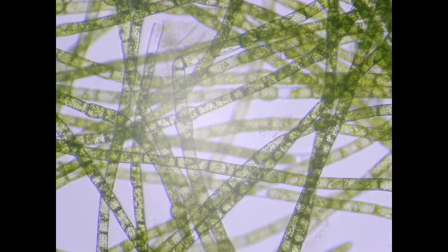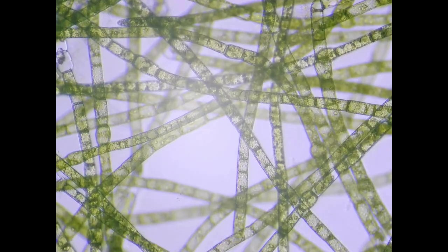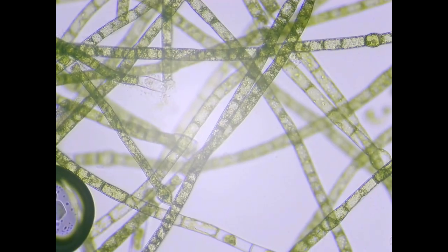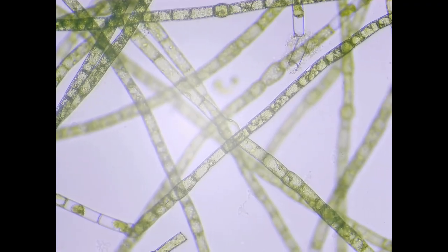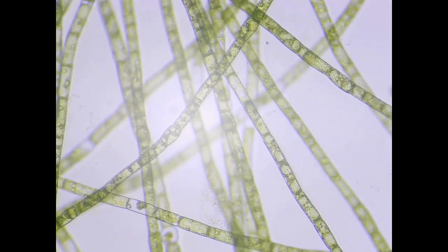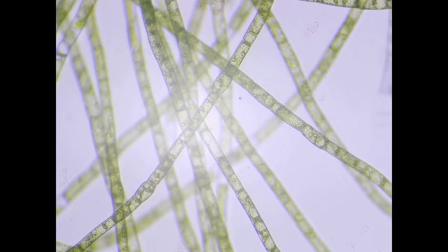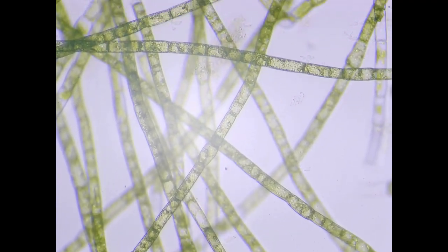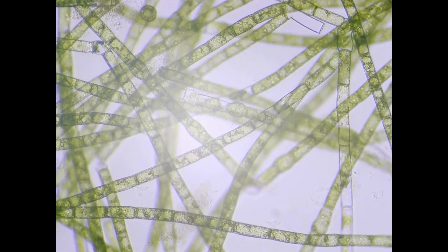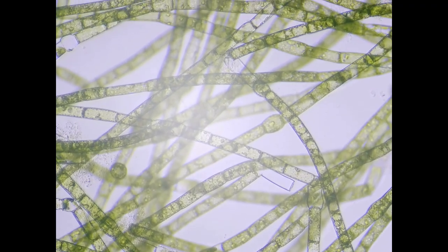Cells are uninucleate and have a ring-like or net-like chloroplast with many pyrenoids. Oedogonium reproduces by zoospores, which are motile flagellated cells. Zoospores are formed in specialized cells called zoosporangia. Oedogonium plays a role in oxygen production and nutrient recycling in aquatic systems and serves as food for aquatic invertebrates.